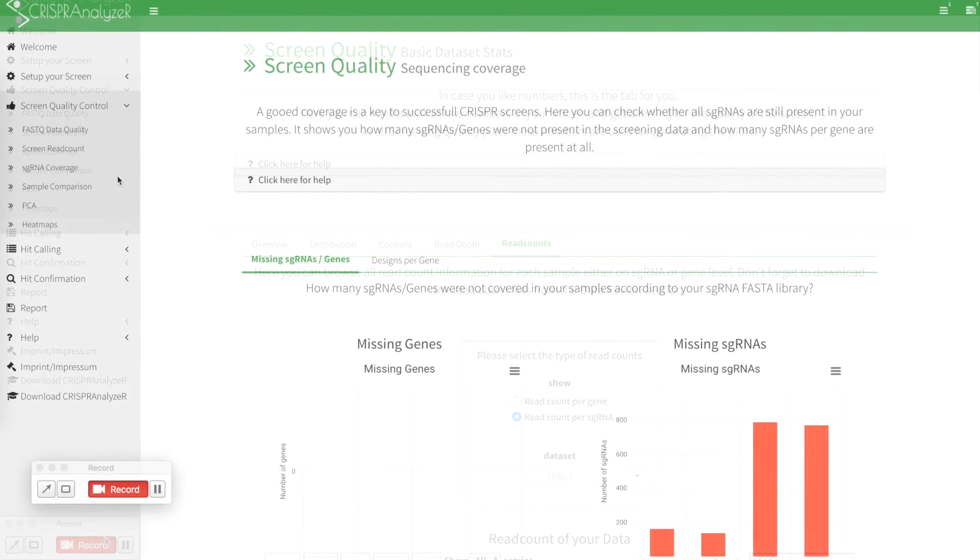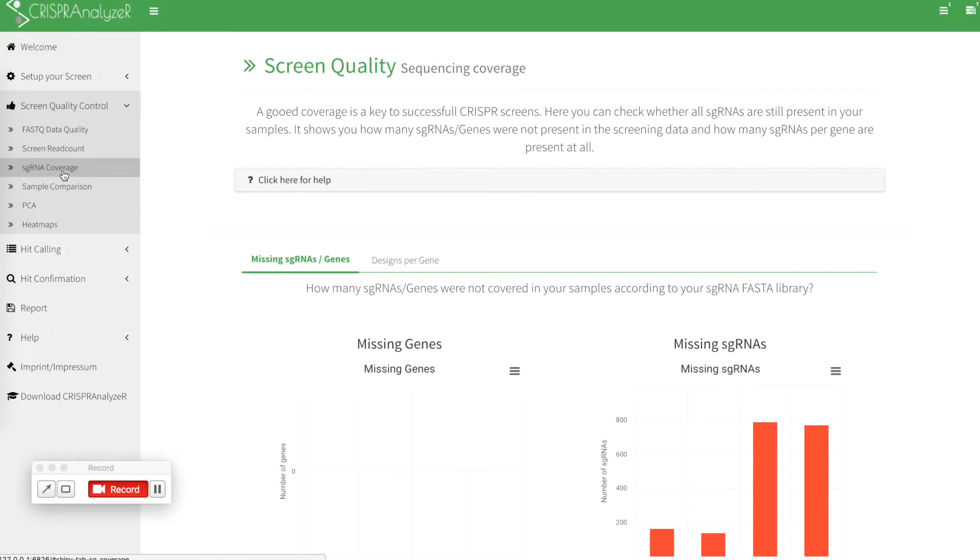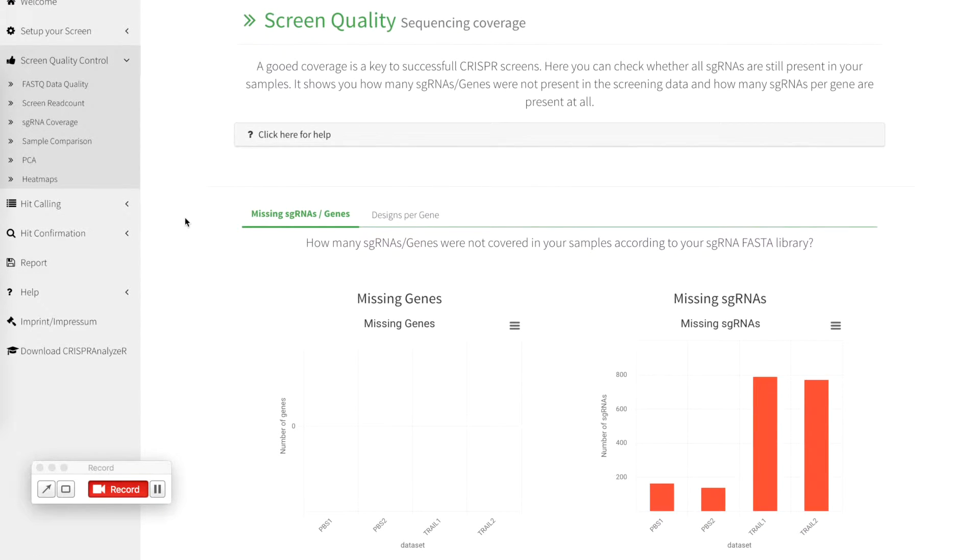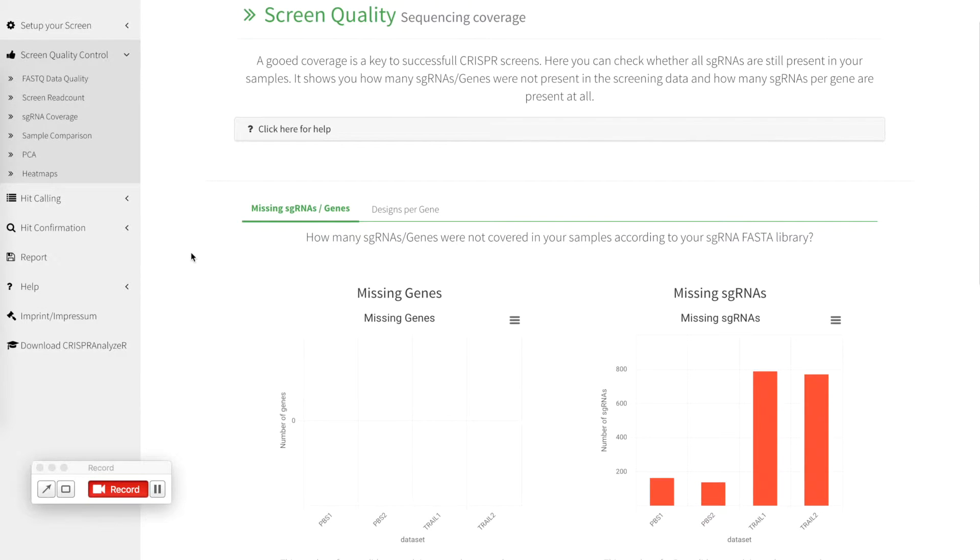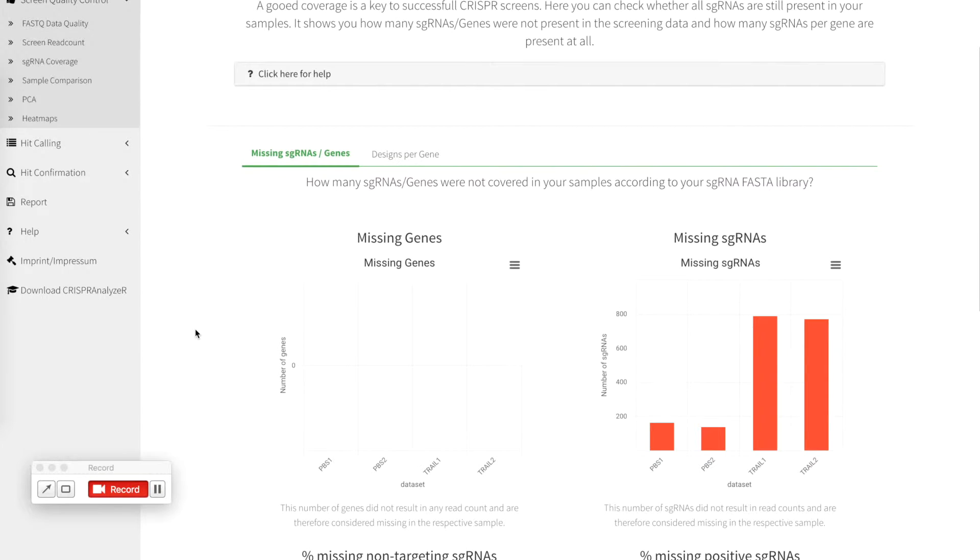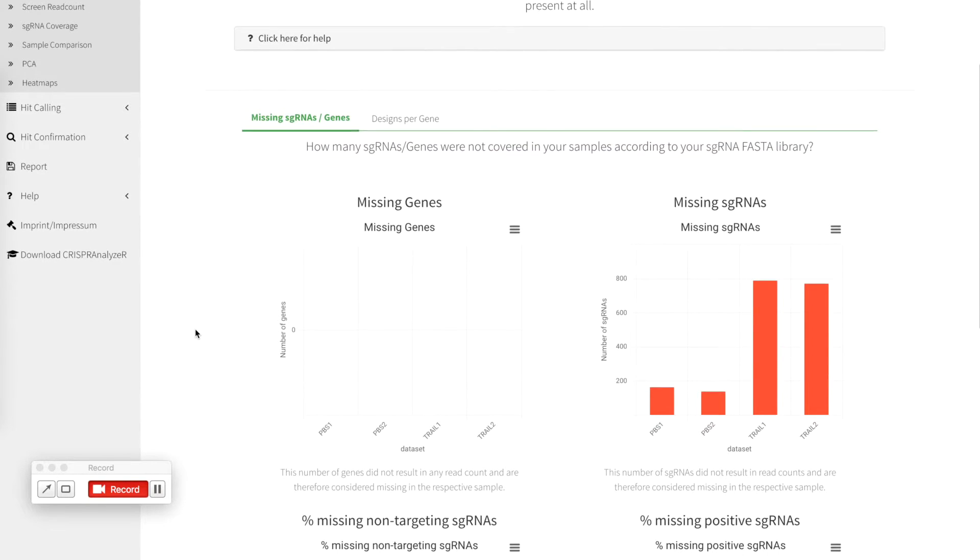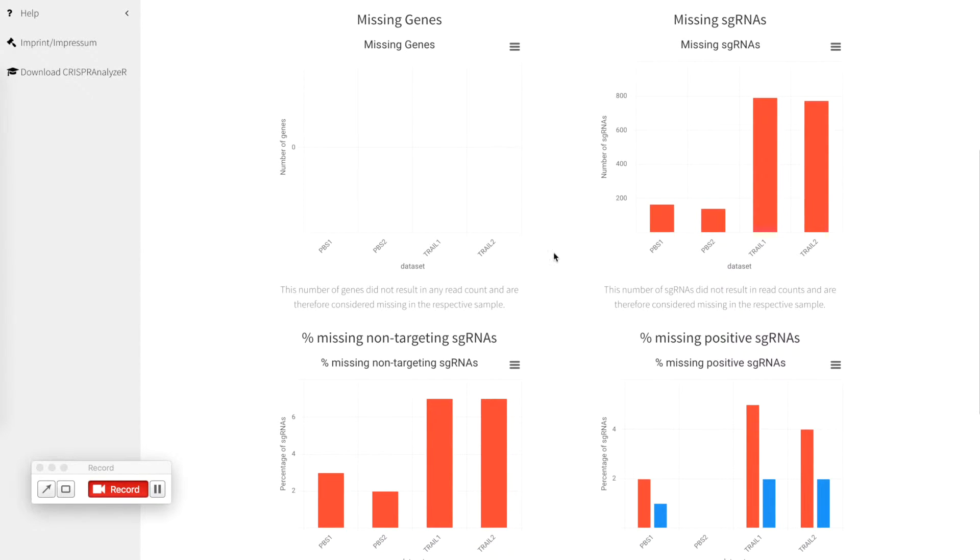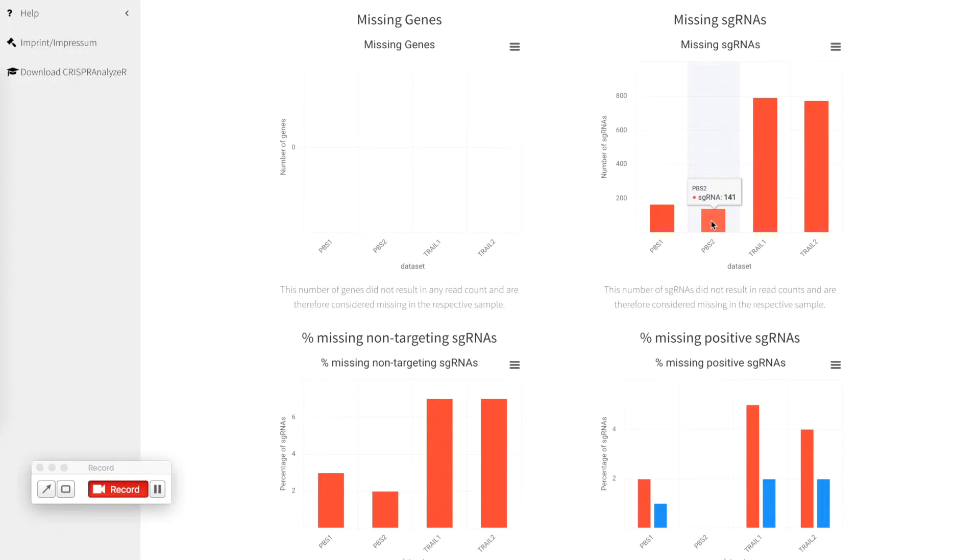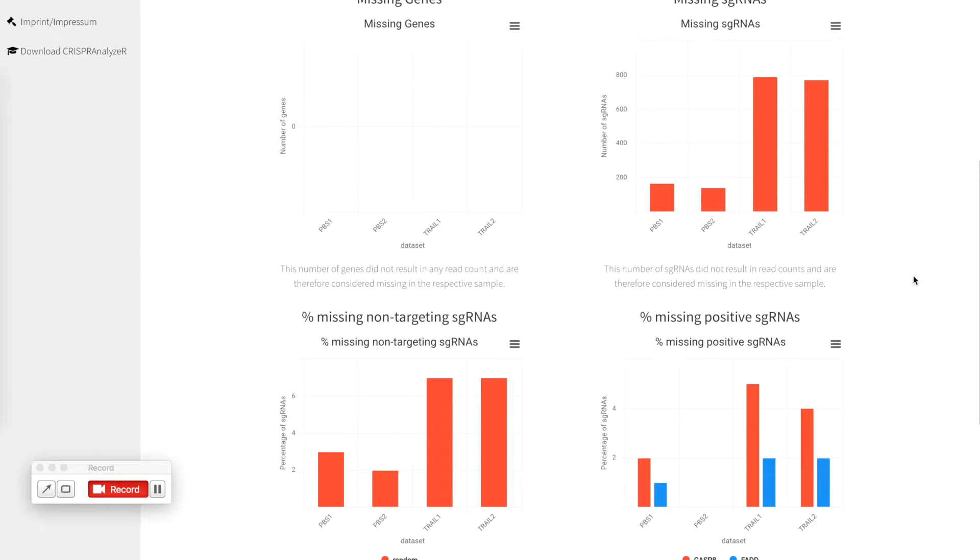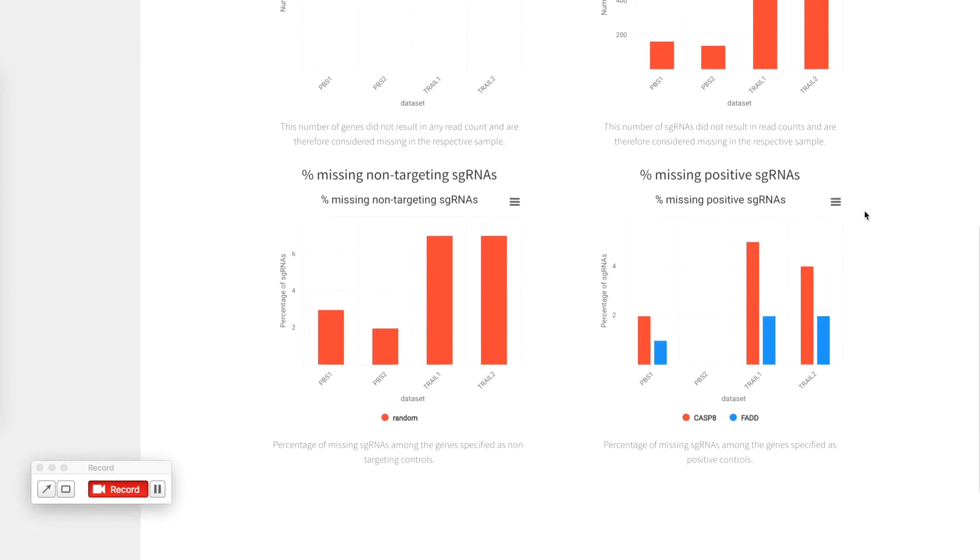Now we are in the sgRNA coverage section of the screen quality control which shows you in case you have not removed sgRNAs with a low read count how many sgRNAs or genes were not present in your data set. You can see that at least one sgRNA for each gene is still present but you can also see that for our untreated controls 166 and 141 out of 12,000 sgRNAs are missing and after trial treatment we lost roughly 800 sgRNAs out of our 12,000 sgRNAs. This is for a drug enrichment screen unexpected behavior.